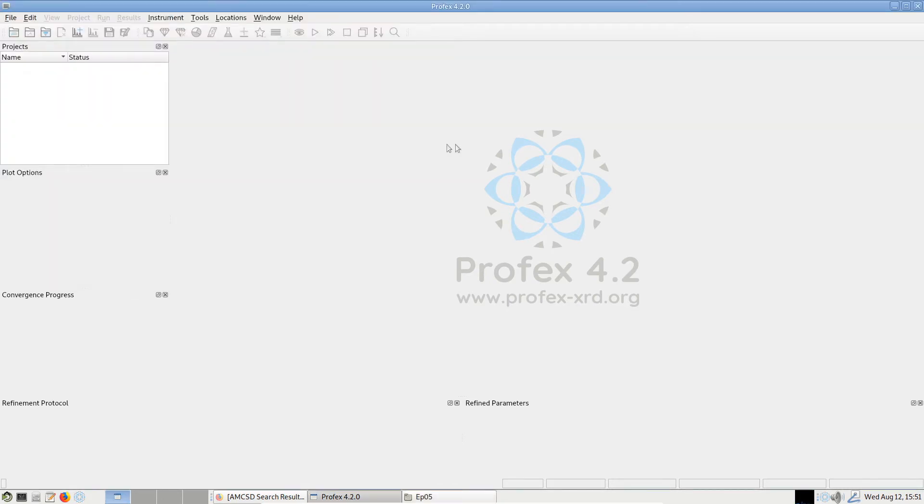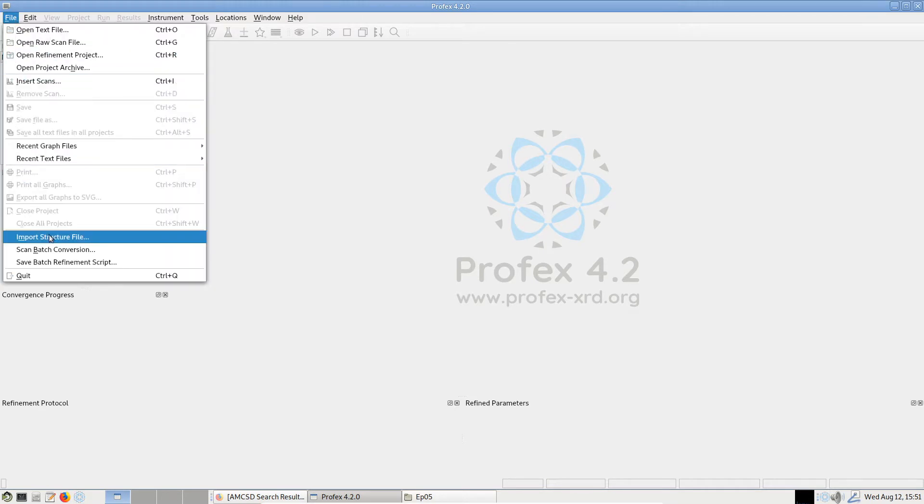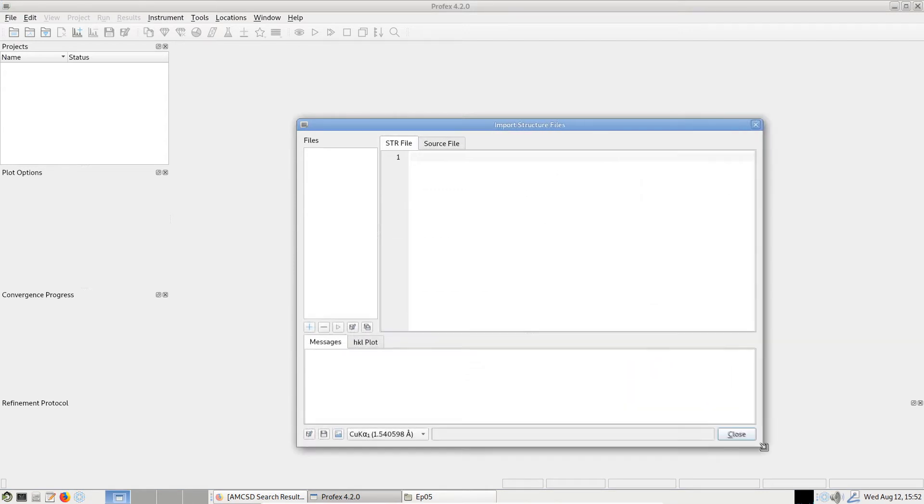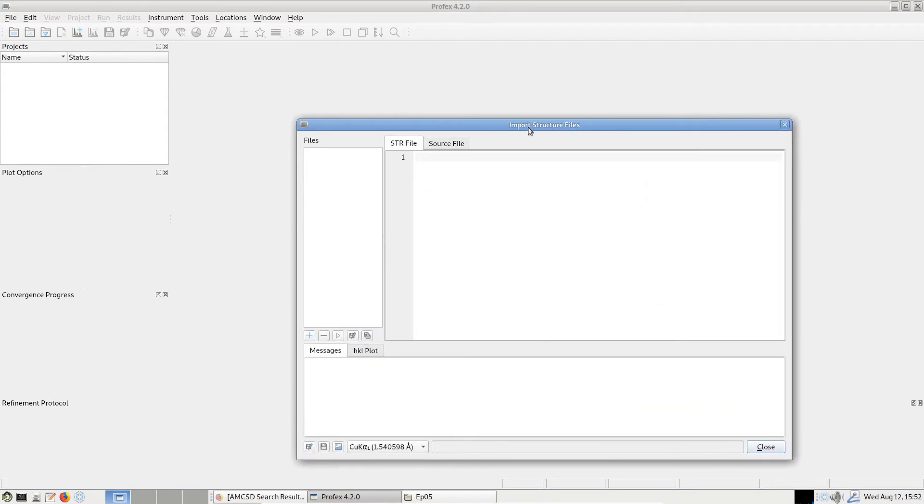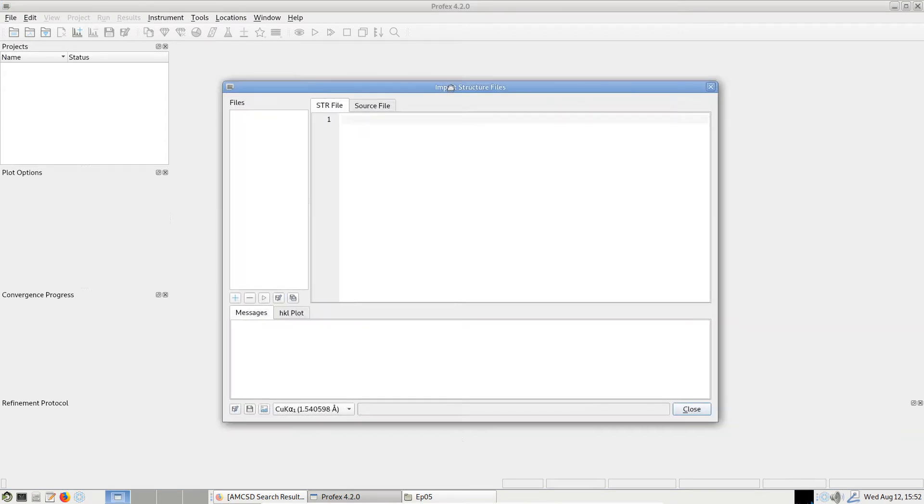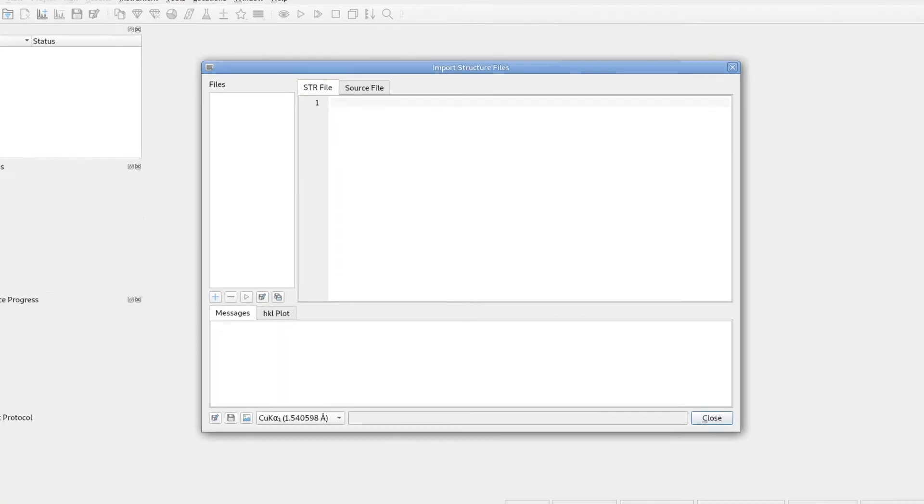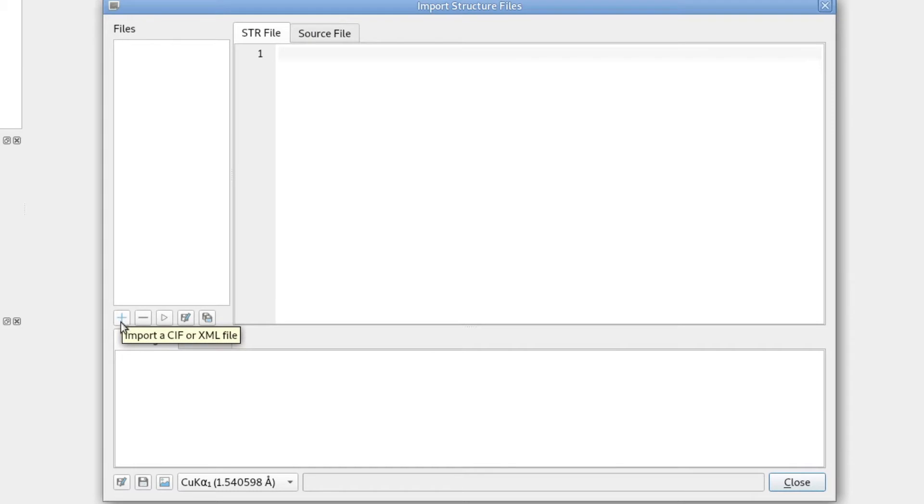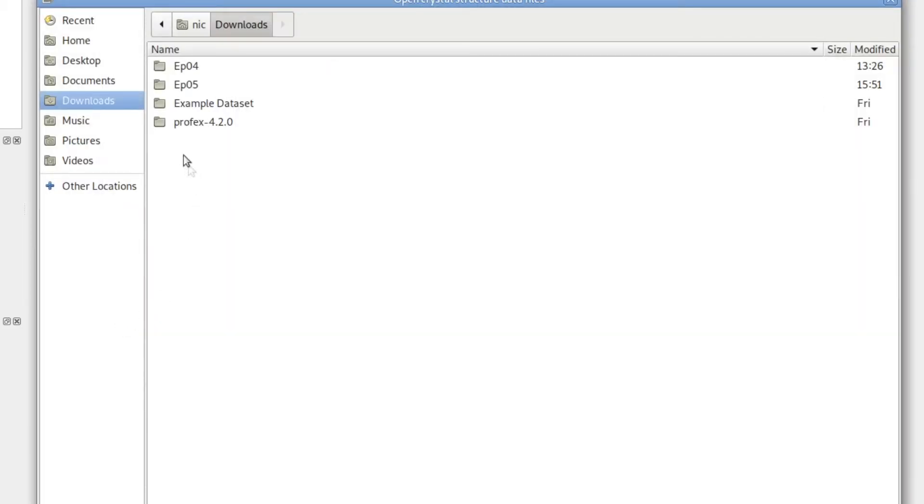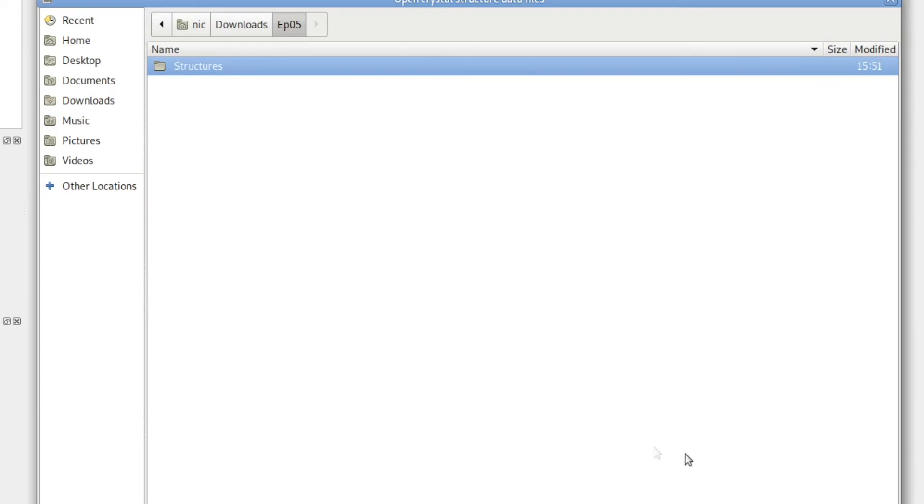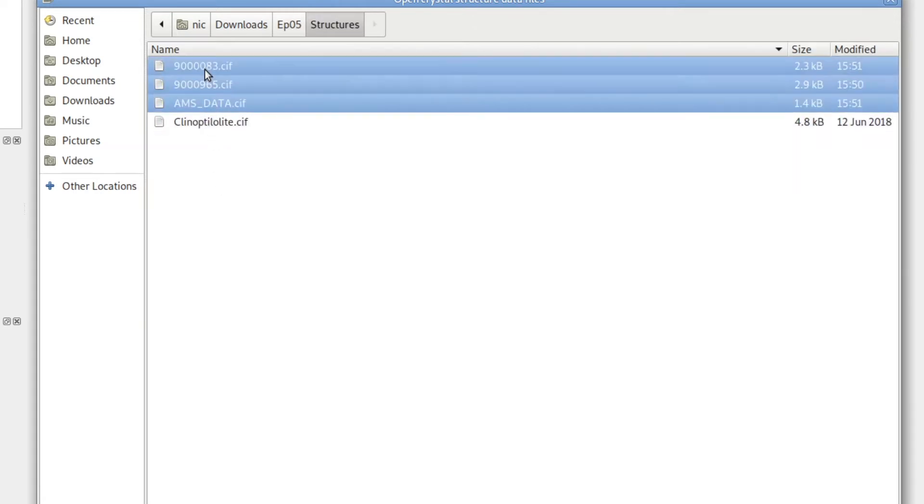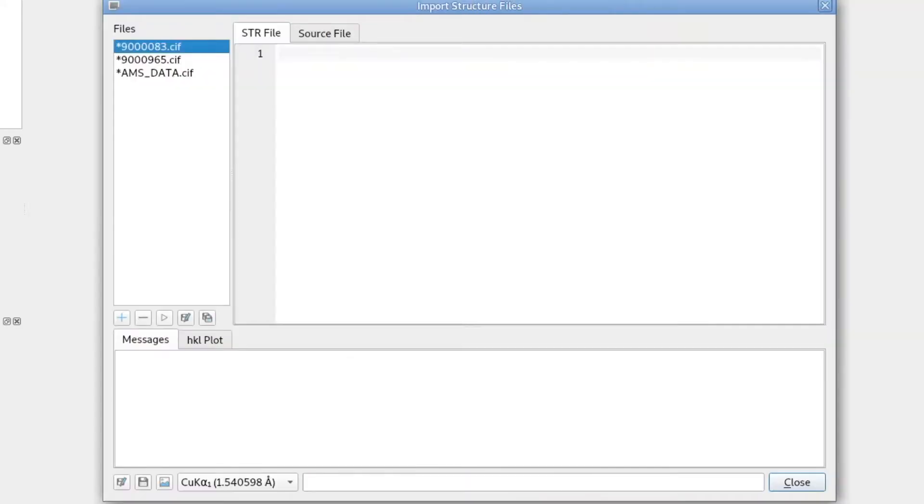Now we can go to Profex and import the files using File > Import Structure Files which will open a dialog. It's still empty. Let's increase the size. To open the CIF files we just click the plus button, and we have to make sure that the CIF format is selected in the format box. We can open the three files we just downloaded, all at once.